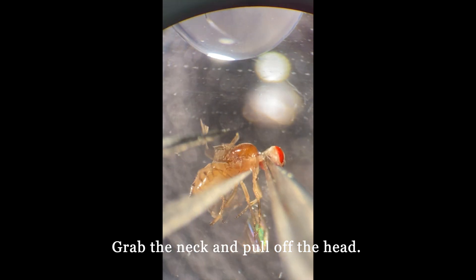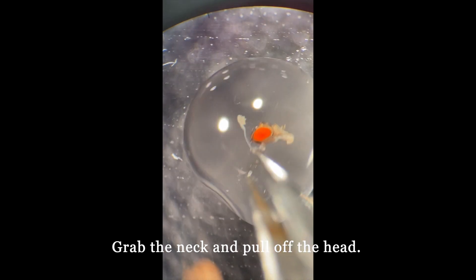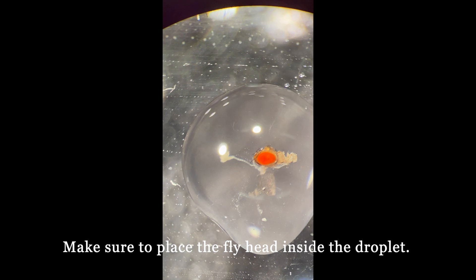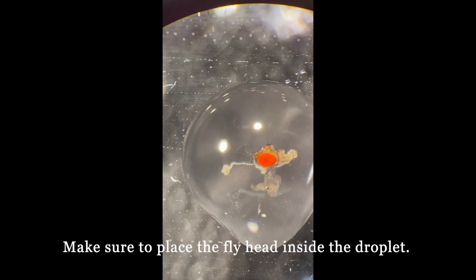Now, we grab the neck and pull off the head. Make sure to immerse the head inside the droplet. Do not let it float on the top.